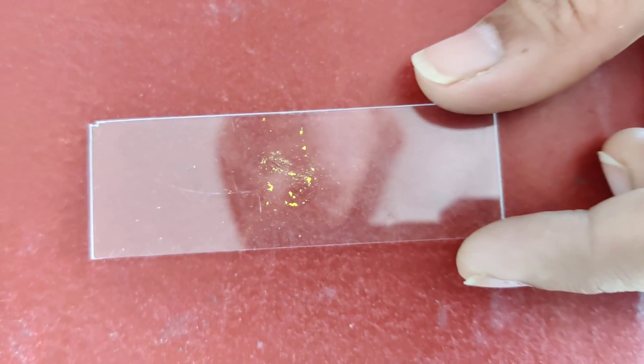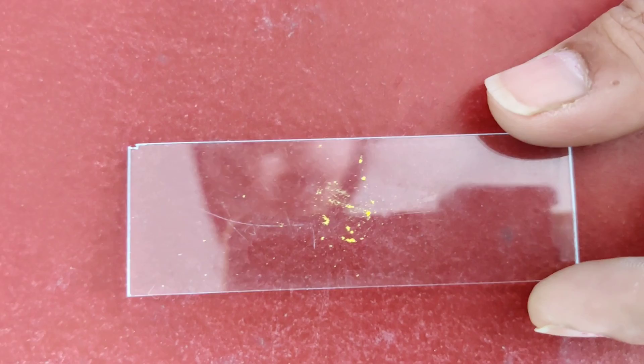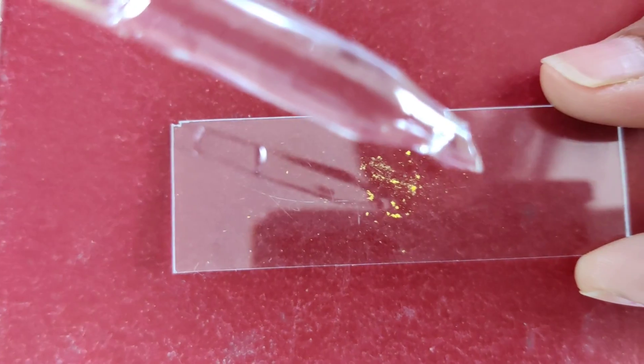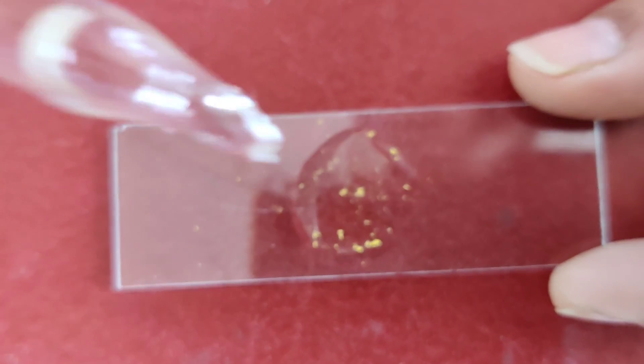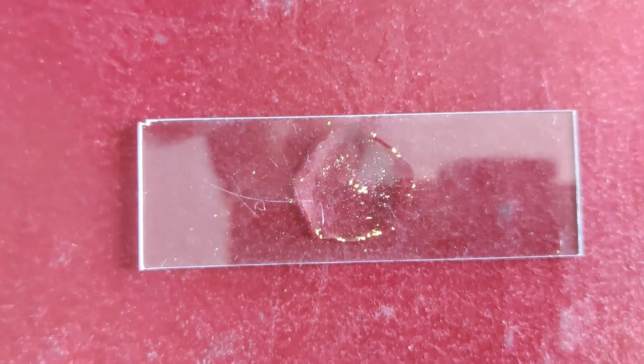Now we have to put one or two drops of the nutrient solution that we prepared onto the pollen grains. We are placing two drops of the nutrient solution over the pollen grains on the slide. Now we will put the cover slip.